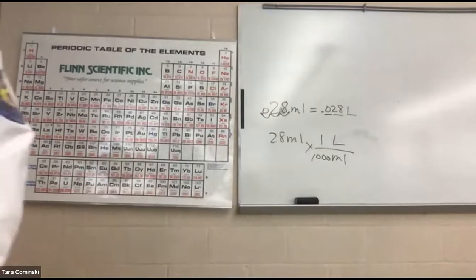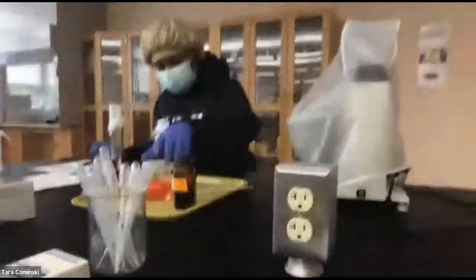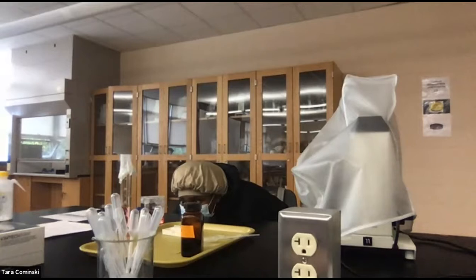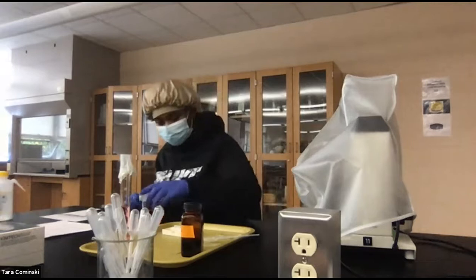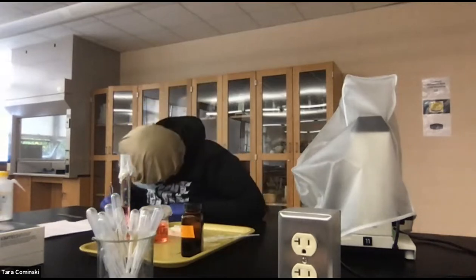Now it asks you to measure the amount of water in the beaker. We'll swing back to Erica here. So there's your beaker. How much do you have there? Estimate the best you can. And 27. All right. Write that down. What do you got there? So what do you think?